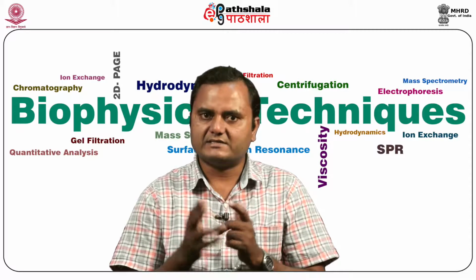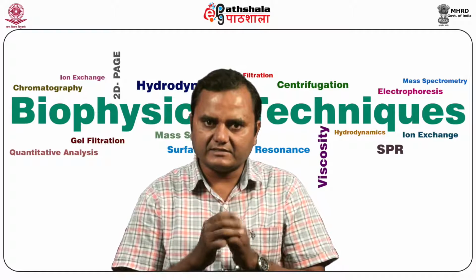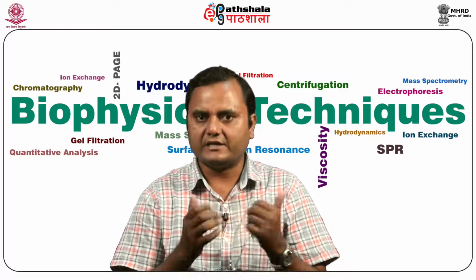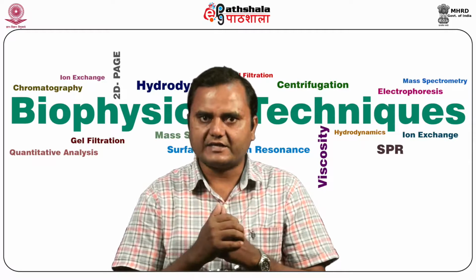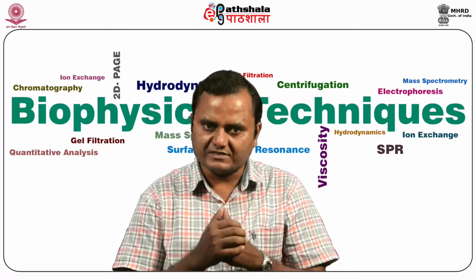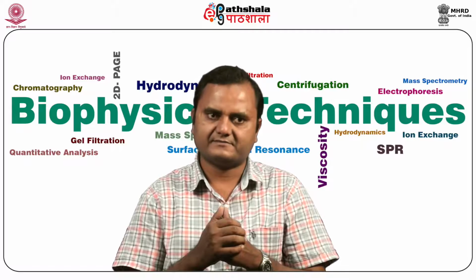So, it is given by the symbol S, and that implies the unit of S per radian square, but the radian square is generally ignored. So, only the S is taken into consideration for the measurement of physical or biophysical properties of macromolecules.